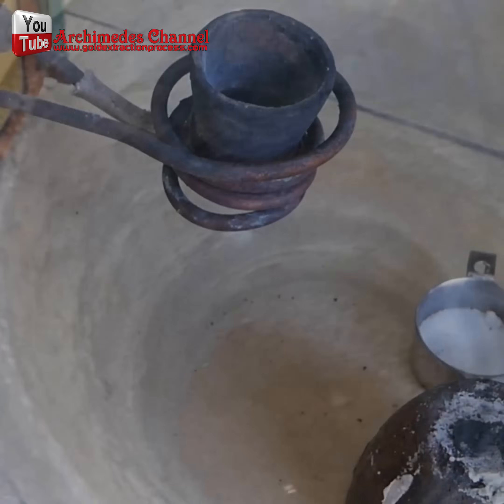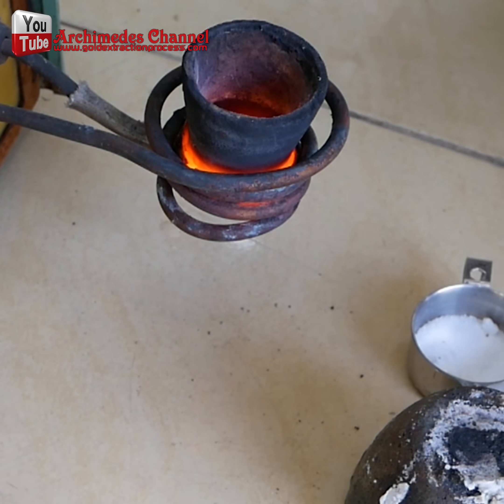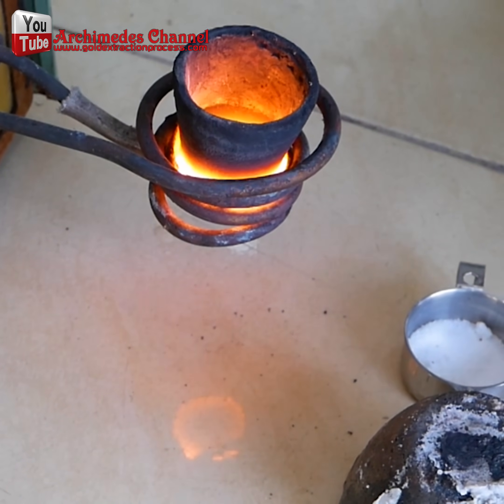Later, I used an induction heater together with a graphite crucible to melt the gold particles. This was both fast and effective.